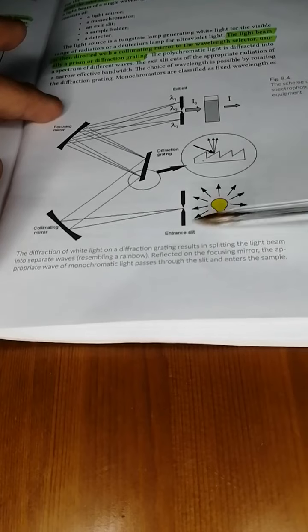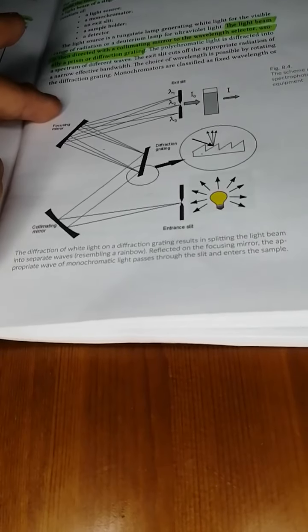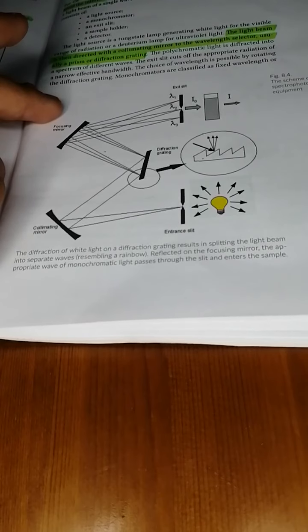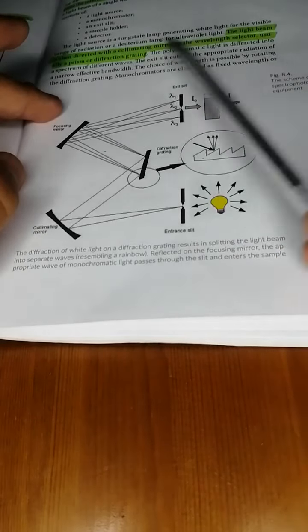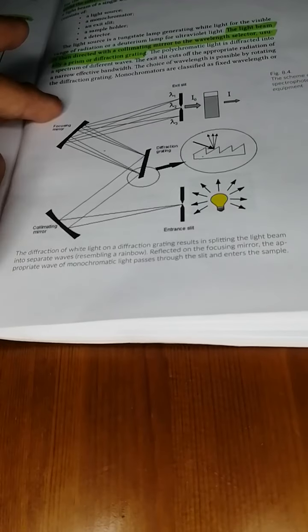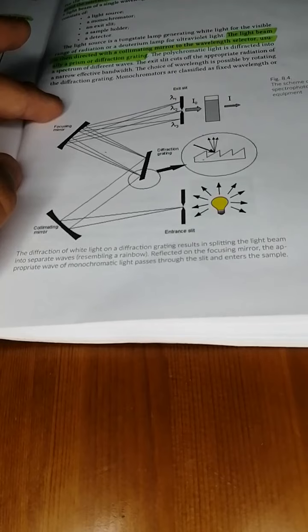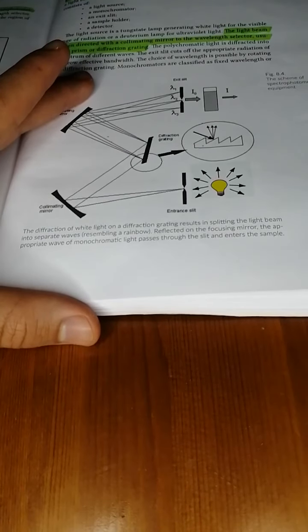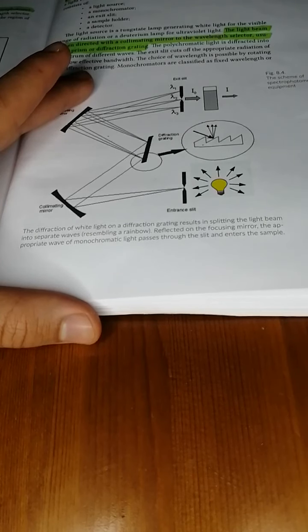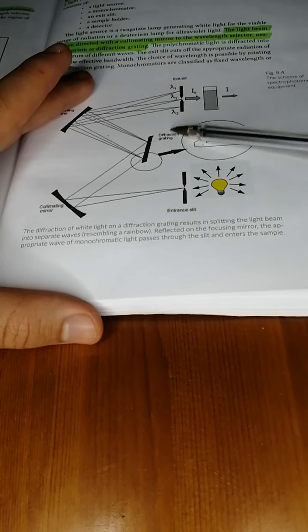Visible light, like the light you get from the sun, contains all the components of the spectrum, all the colors of light. If you're acquainted with physics, you will know that different colors of light translate to different wavelengths.